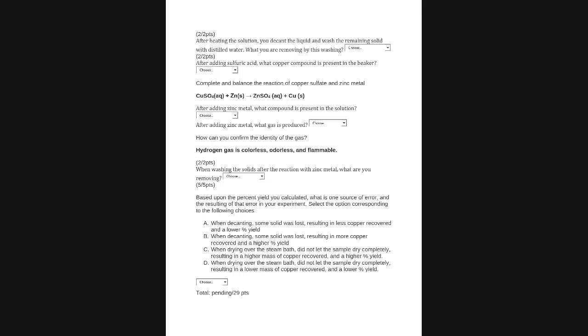What are you removing by this washing? And we said that we are removing what? Do you remember what we said? Somebody? Yes, thank you. Perfect. We are removing the sodium nitrate. That's correct. And then they say, after adding sulfuric acid, what copper compound is present in the beaker?